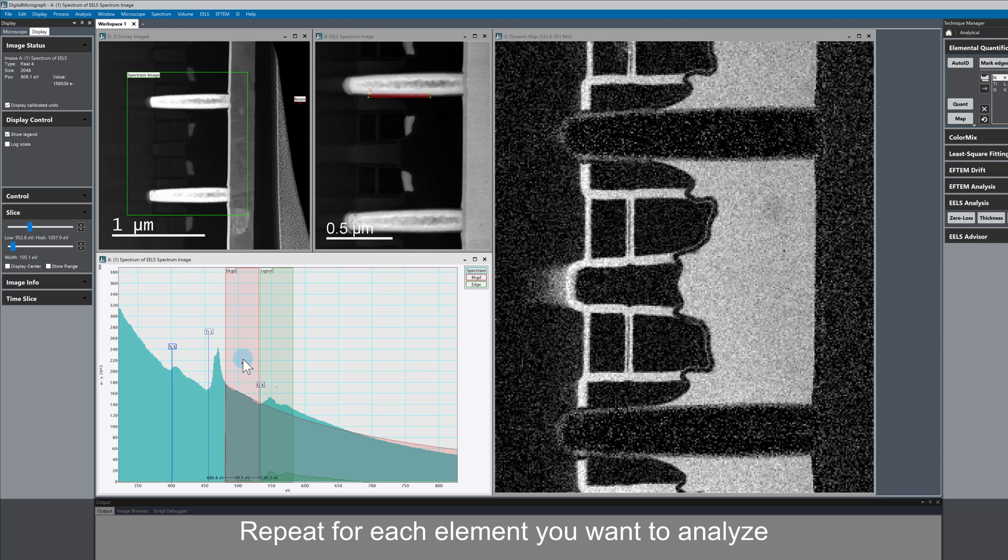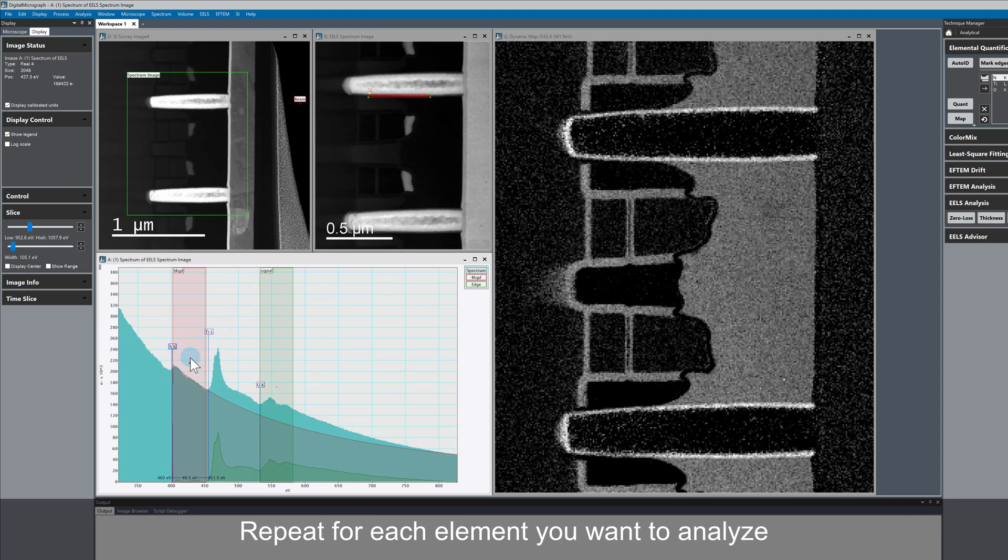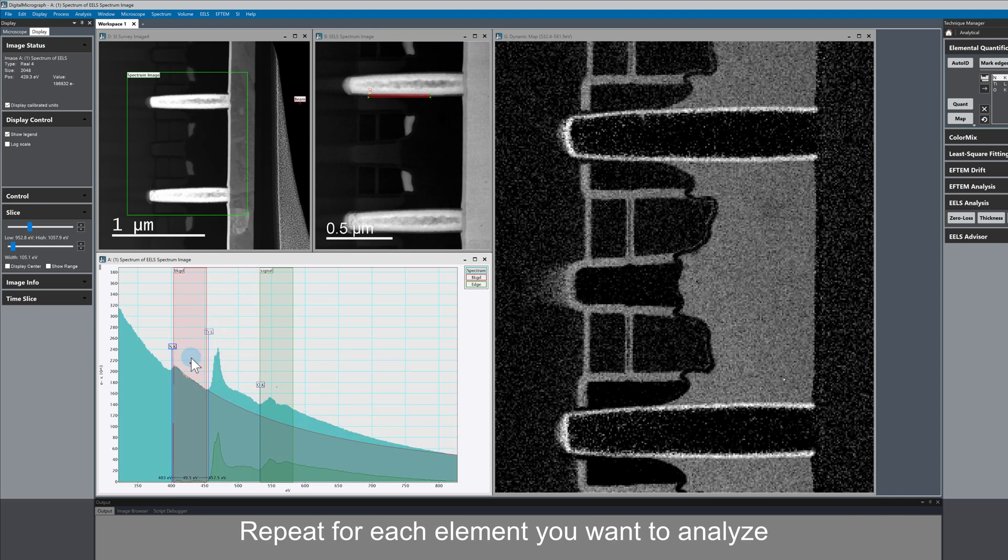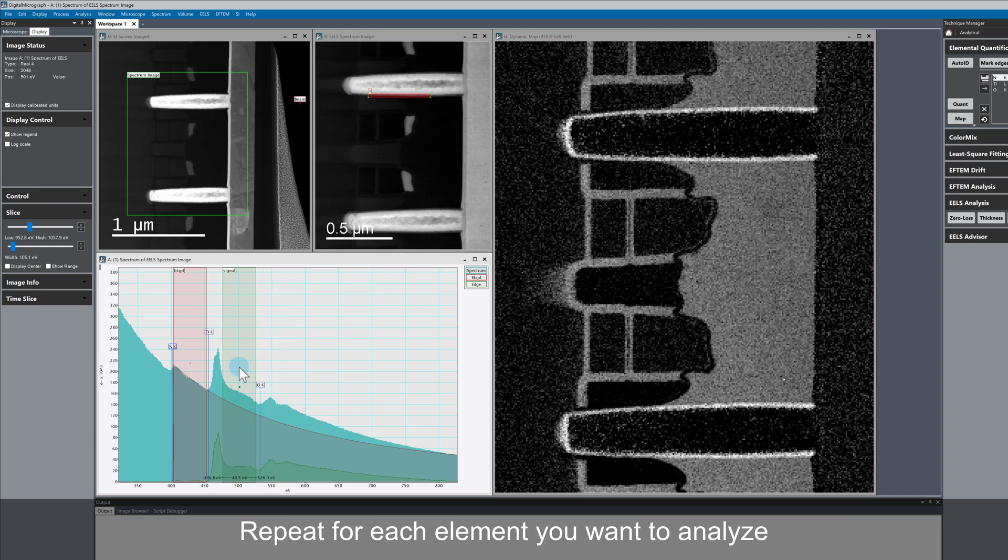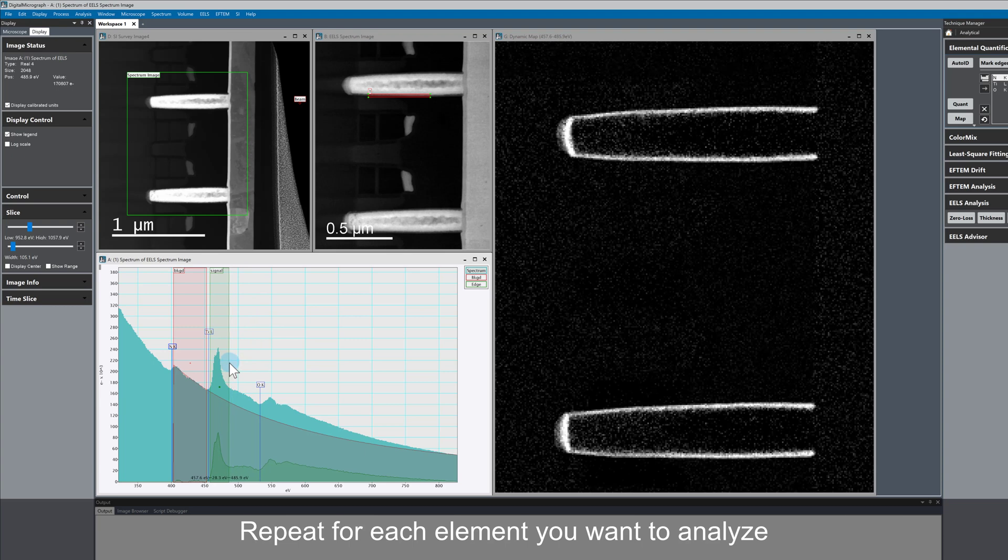We can go ahead and do the same for titanium. Where are the titanium rich regions in the sample? Move the background window, change the signal window, and the map changes again.